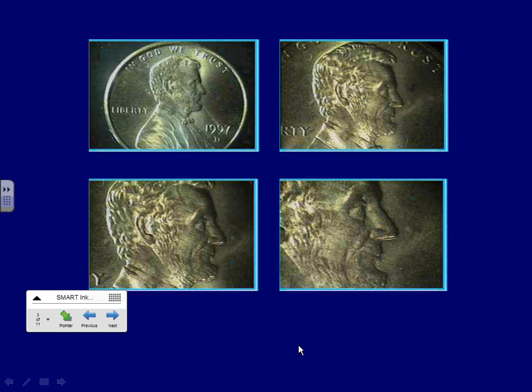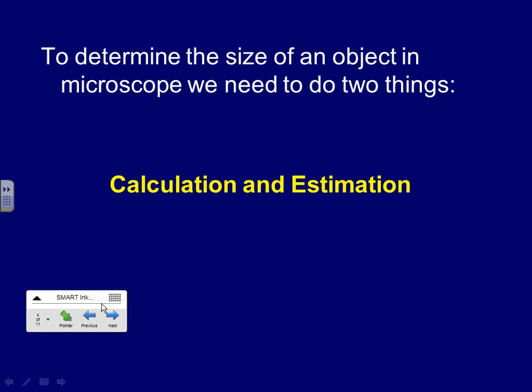And I've got just some images of this. Now, this isn't a classic field of view because it's a rectangle, but it does get it across. A classic field of view would have been a circle, but you can see there, this is an American penny, and as we change to greater magnification, the area is much smaller, but we can see the detail much greater. All right? Any questions on that? It's pretty straightforward stuff. I'm just pointing out probably the obvious that maybe you have already observed.